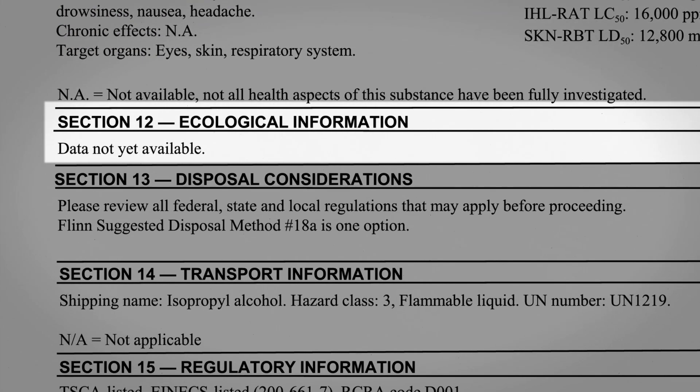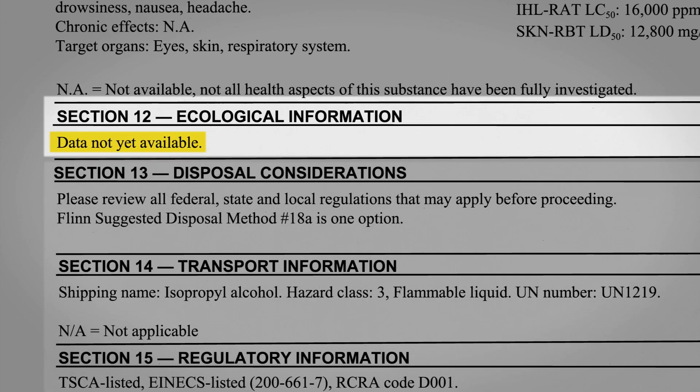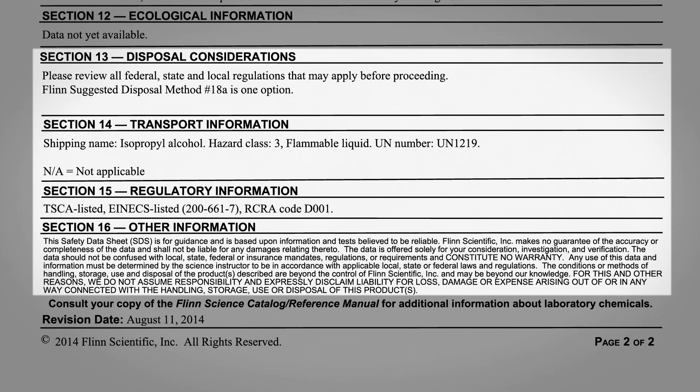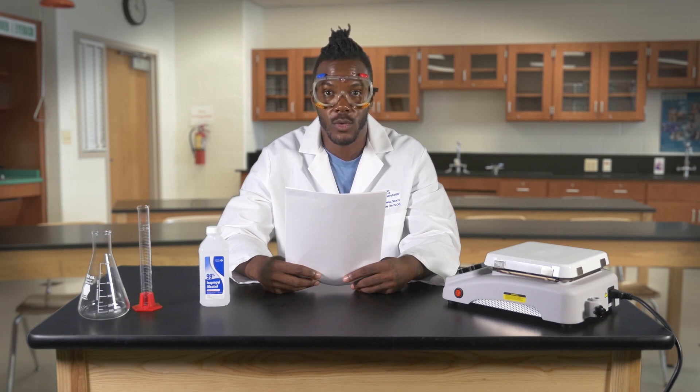Section 12 provides information about the effect a chemical may have on the environment. Sections 13 through 16 concern regulations for the disposal, transportation, and industrial use of chemicals, and are beyond the scope of this video. Remember, working safely with chemicals requires that you recognize their hazards, understand risks, minimize those risks, and prepare for emergencies. All of this information can be found in the SDS, which is why it's such an important document and crucial for your safety in the lab.